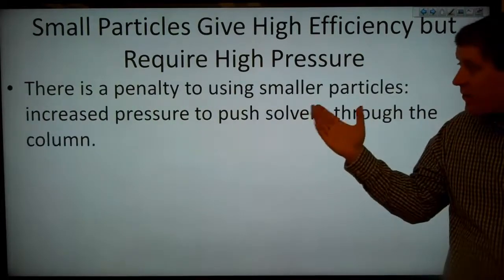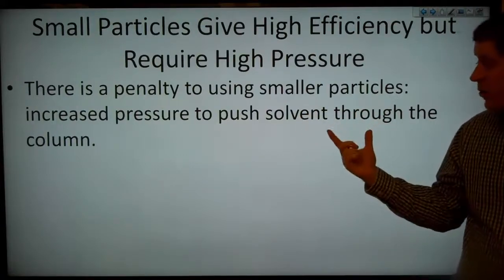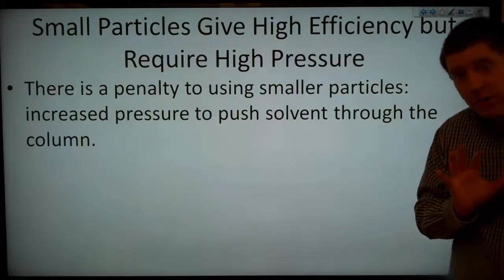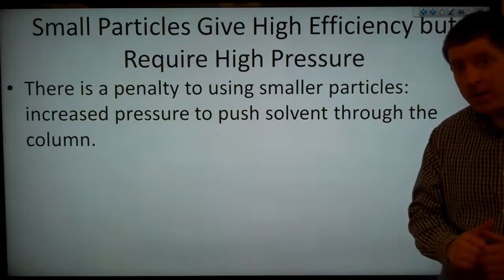Now, there is a penalty to using smaller particles: increased pressure to push the solvent through the column, because as those channels between the particles get smaller, we're going to have to push the solvent harder in order to force it through those narrower channels.